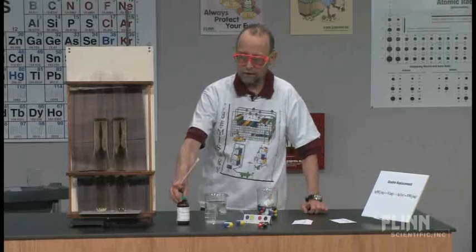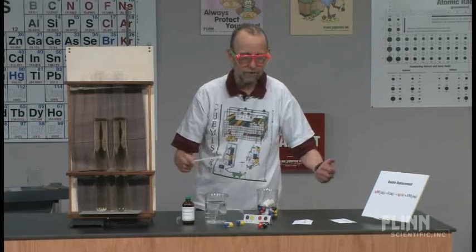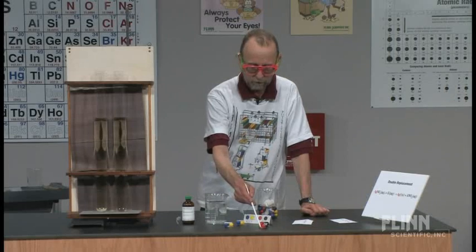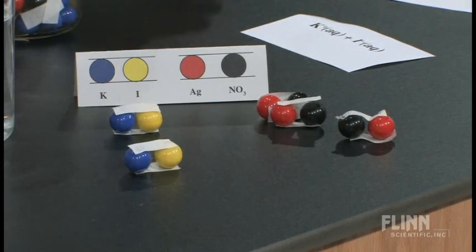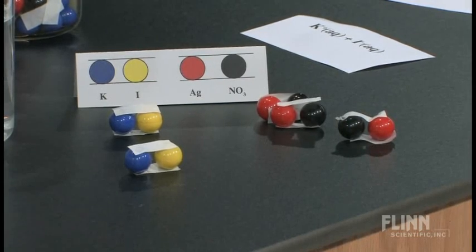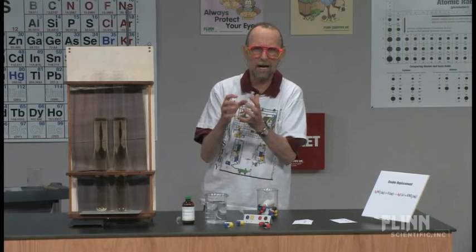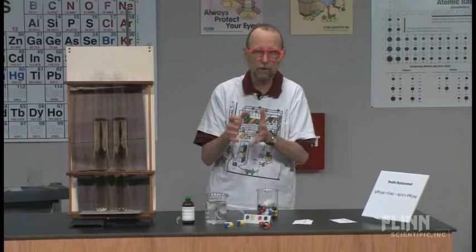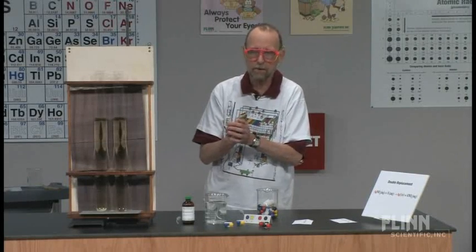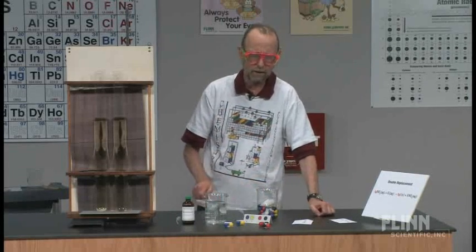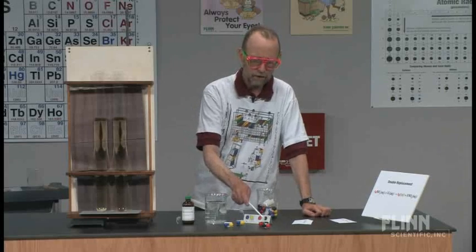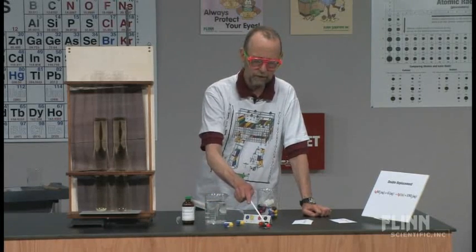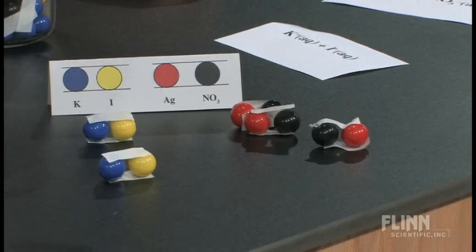In this bottle right here is the silver nitrate. I took solid silver nitrate, and that's represented by this model. The red is the silver, the black is the nitrate. Think of that nitrate polyatomic ion as a big blob. We're going to treat it as one thing. There's the bond that holds the nitrate polyatomic ion and the silver together.